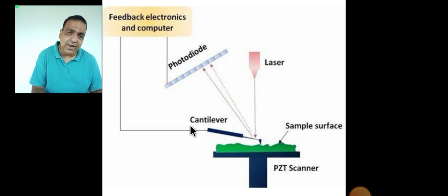In both of these microscopes, we saw that there's a need of generating a vacuum inside the chambers where this all photography has to be executed. But here, in case of atomic force microscopy, we can perform the experiment even in the situations where there is the presence of some moderate quantities of air or in liquid.